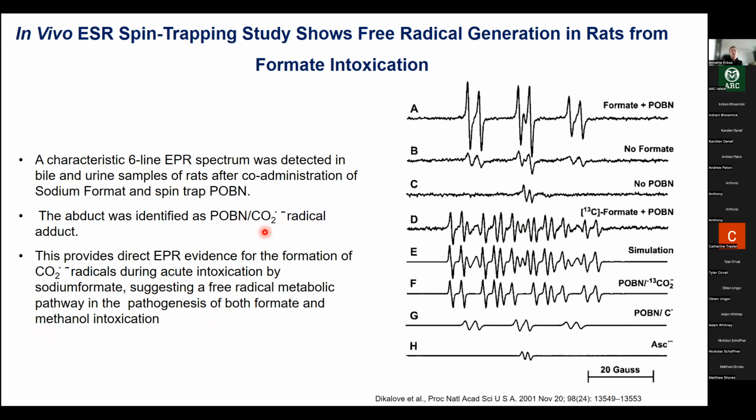Okay, so this is where I actually planned on stopping for today. I know in my abstract, I promised you I would talk about metal proteins and intrinsic radicals. But when I put this talk together, I realized that if I do that, I cannot go into any of those methods to a point that the talk would actually be pretty useless. So I thought I'll go into what I know best in more detail, and hopefully have convinced you that EPR spectroscopy, even if it's as basic as continuous wave and X-band, is a very powerful method to look at biomolecules, and it's really worth considering.